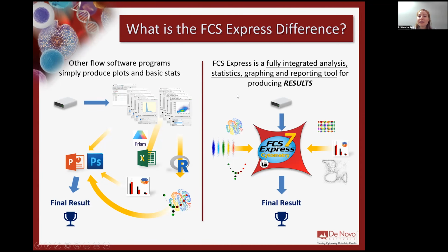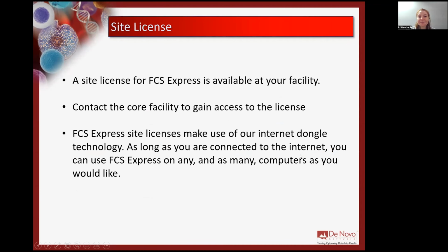So with FCS Express, all of those tools that you're going to need for analysis, statistics, graphing, and reporting are all going to be available in one software package. So you aren't going to need to use all of those other packages in order to get your final result. You can get that final result right from FCS Express.